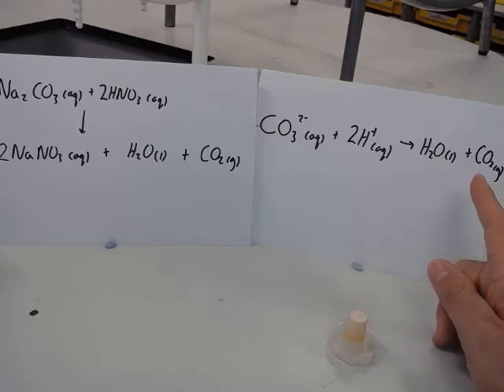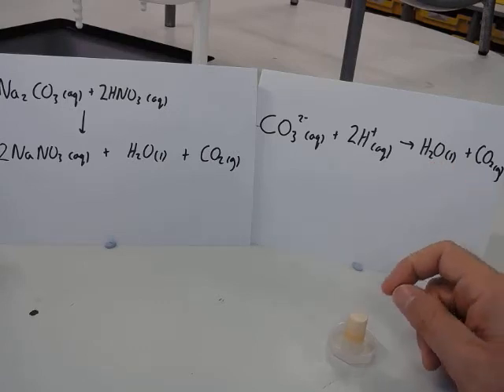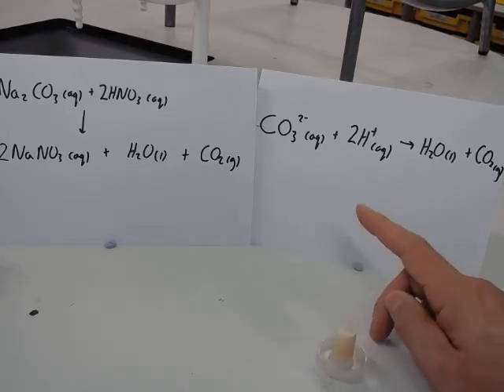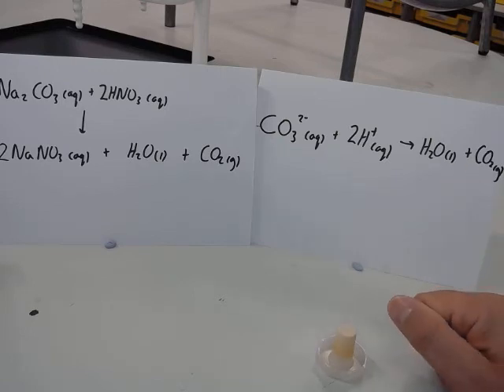So the observation you see is bubbles or effervescence. You can't write I see CO2. Your eyes can't tell it's CO2, but we know from the chemistry that it is. The observation will be effervescence.